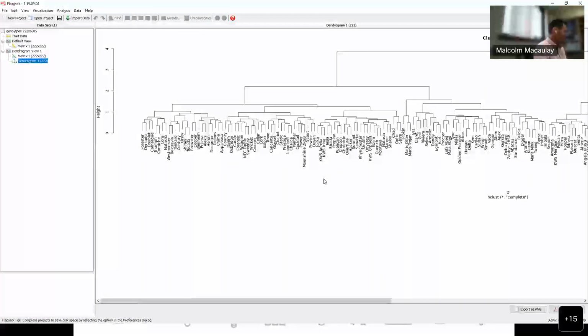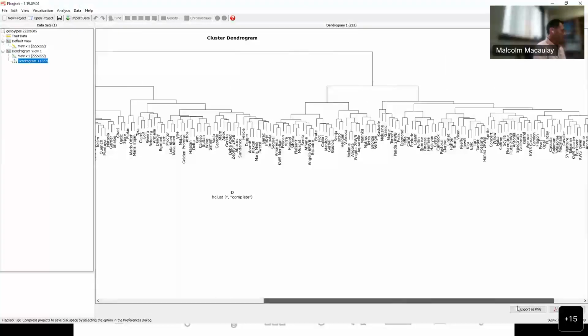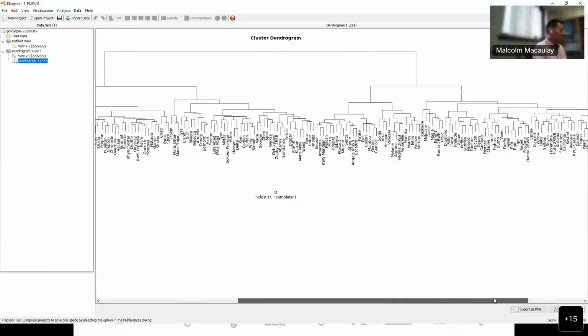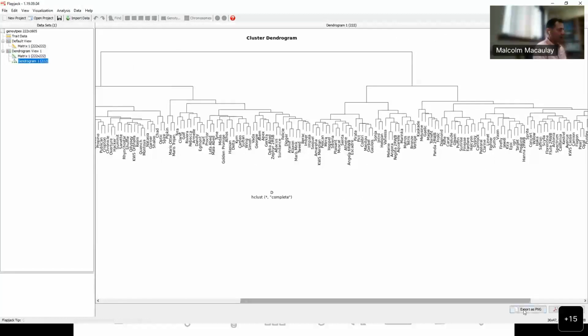Flapjack uses a modified version of the Jaccard index similarity scoring for dendrogram creation, and we can see from the resulting tree from this data there's a major split, and this split comes from growth habit, spring and winter type, in barley, where winter lines require vernalization to initiate flowering. Once you've created your dendrogram, it can be exported as either an image or a PDF file.